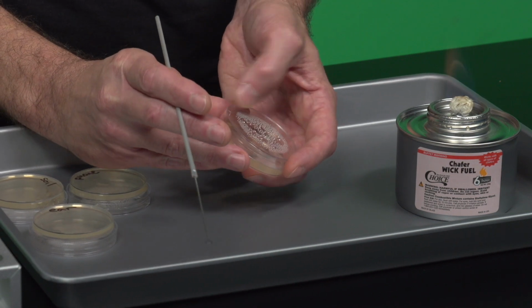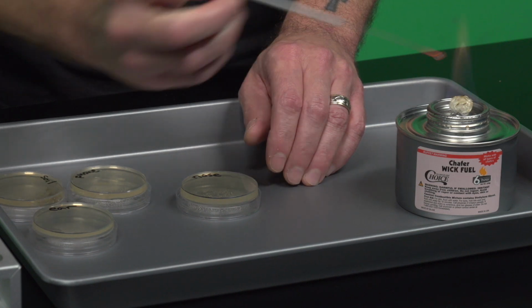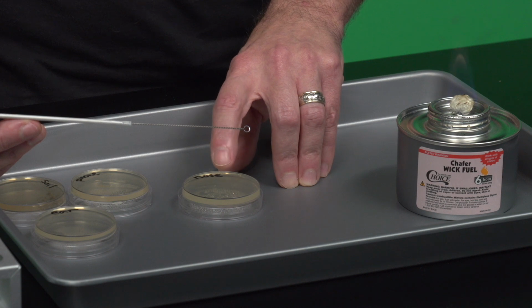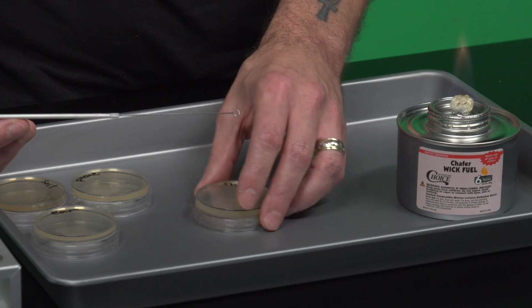In between each streak, it is important to go ahead and sterilize the loop. Because by streaking, you put a bunch of bacteria on the loop in a very concentrated region, or we hope so. So we need to wait 10 to 15 seconds for this to cool down before we take a streak from quadrant 2 and put it into quadrant 3. We'll go ahead and get that going.